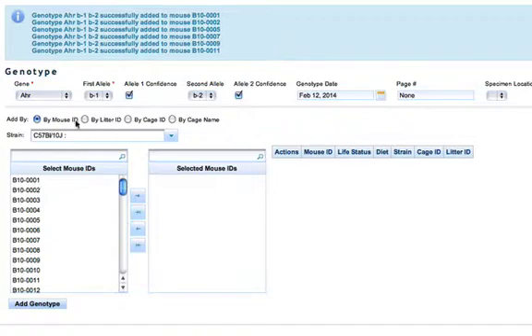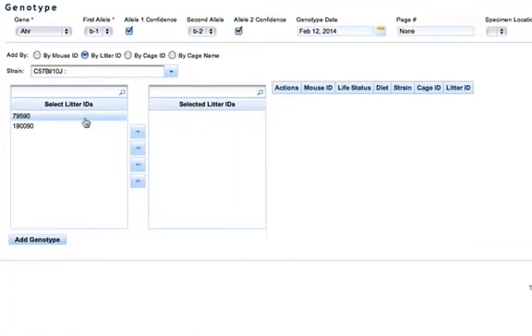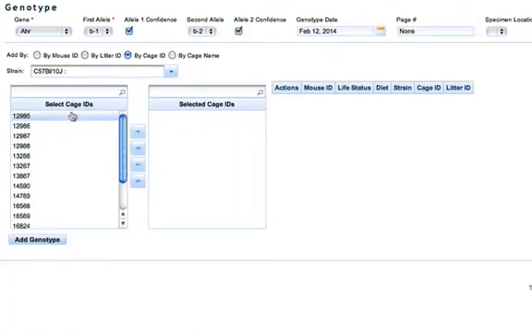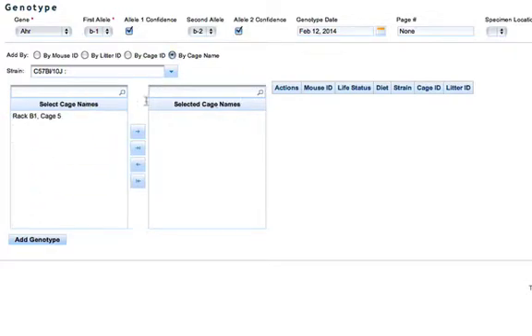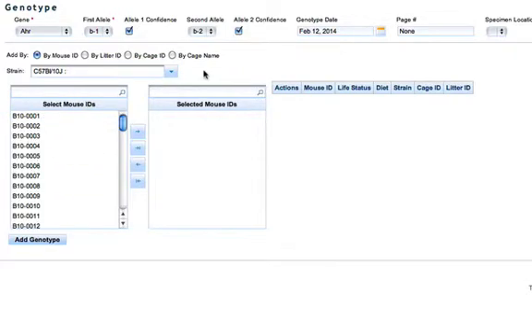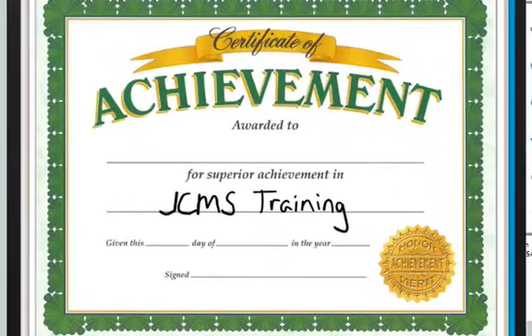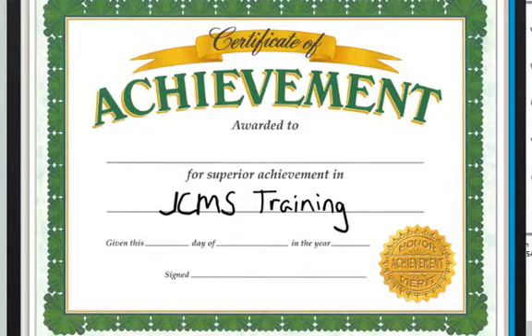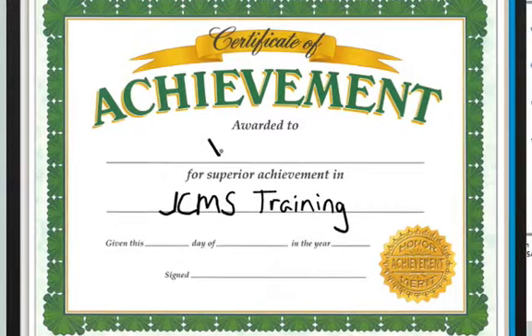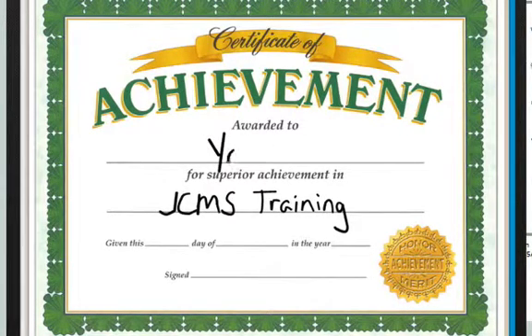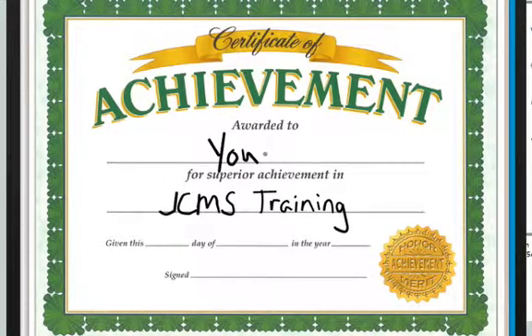As I mentioned, you can choose to add by litter ID, cage ID, or cage name. That concludes our training for genotyping. For more information or to post questions, please visit our website at colonymanagement.jax.org.